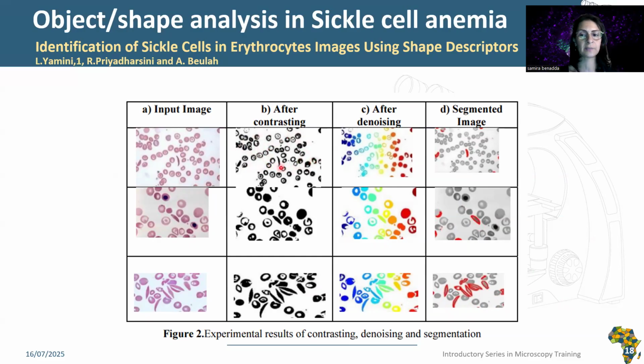In the primary image, each normal cell will have a hole here, since normal red blood cells have the shape of a donut that has been pressed slightly in the middle. The boundaries of all the cells in the image are traced, and the holes inside each cell are filled.